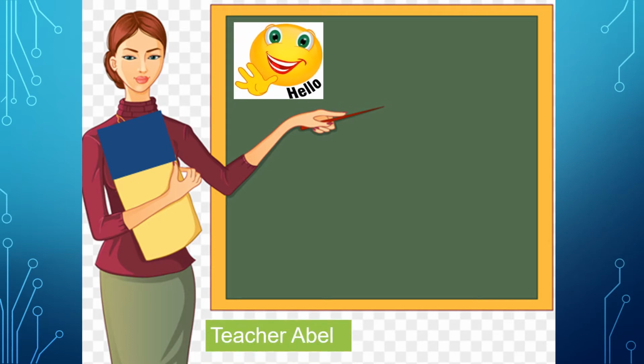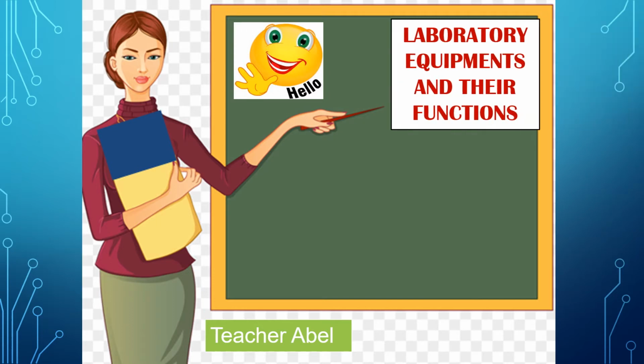So for today, we are going to learn about laboratory equipment and their functions. In science, you always have your experiment or laboratory. So before you have that, you need to learn the laboratory apparatus or the materials that you are going to use and their functions.